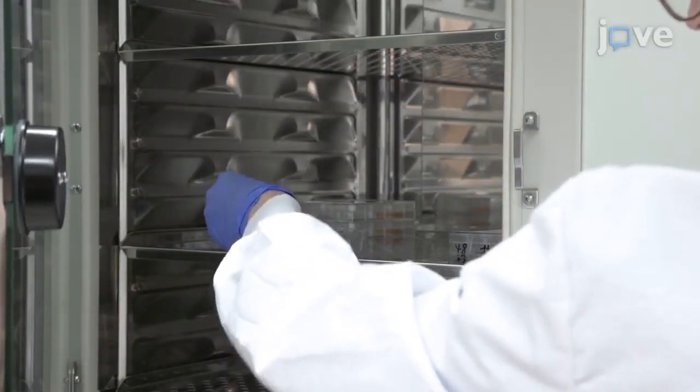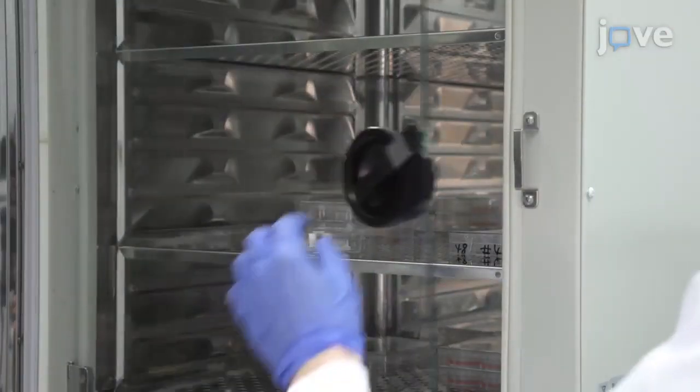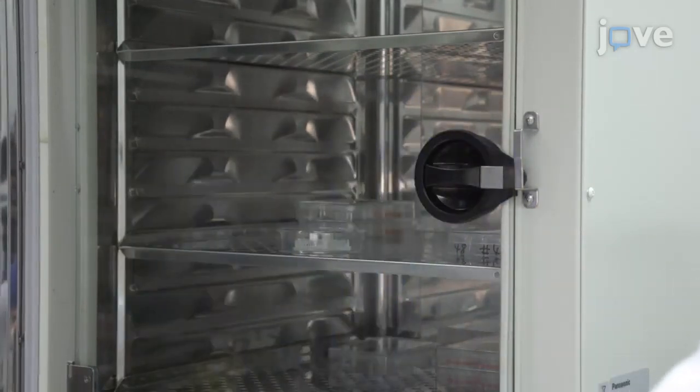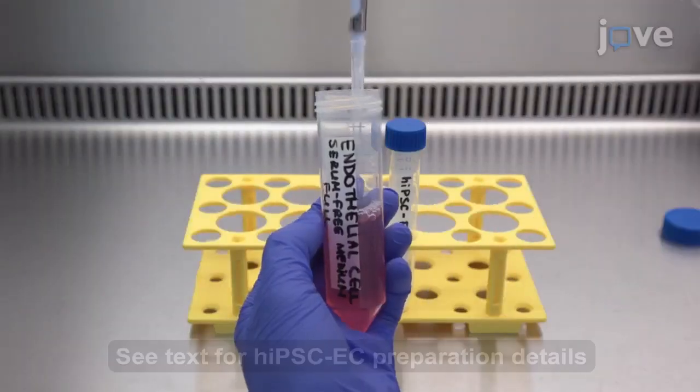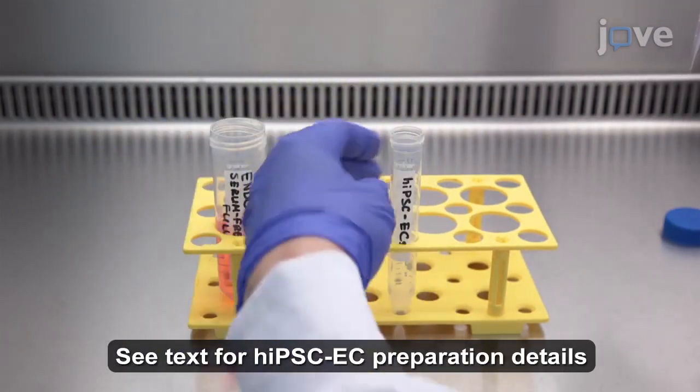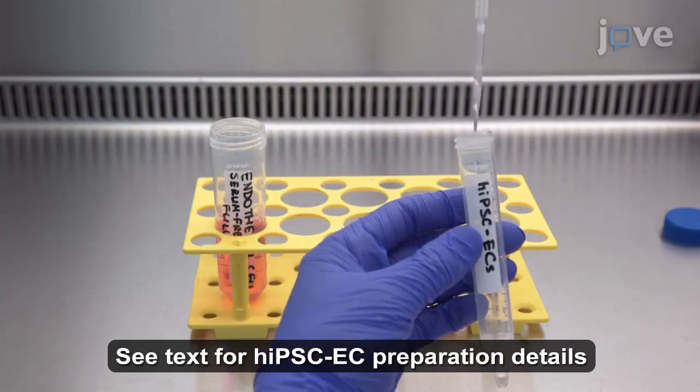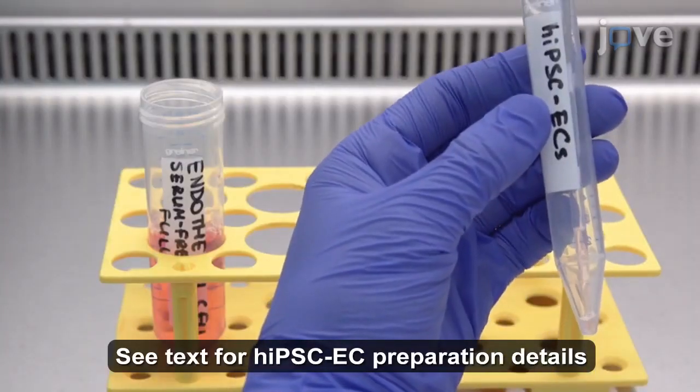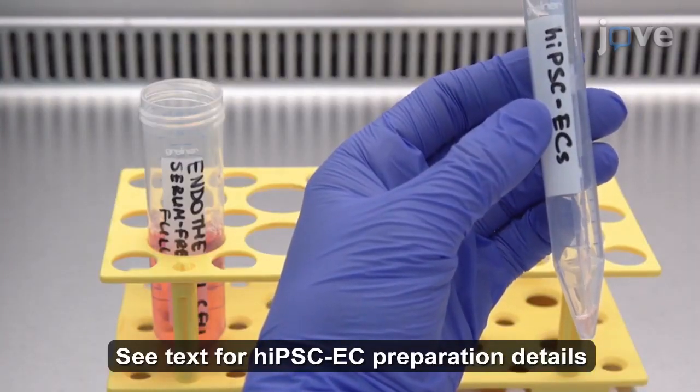The next morning, pre-warm the biochip in a 37°C incubator and re-suspend human induced pluripotent stem cell-derived endothelial cells harvested from an 80-100% confluent cell culture at the desired concentration in fresh endothelial cell serum-free medium.